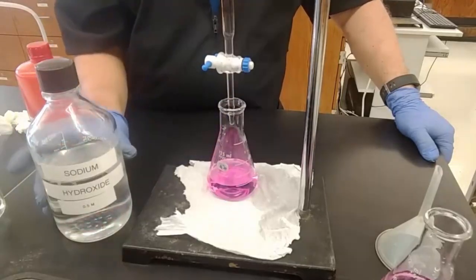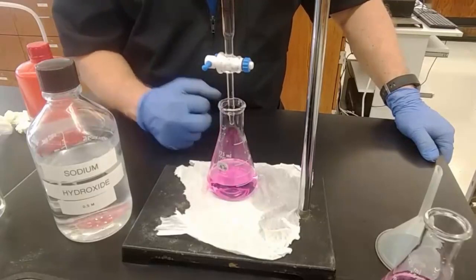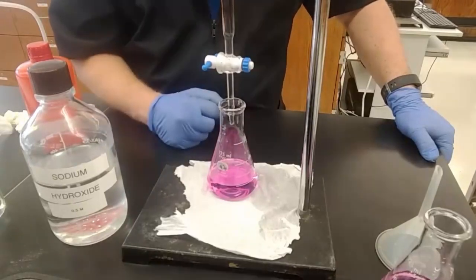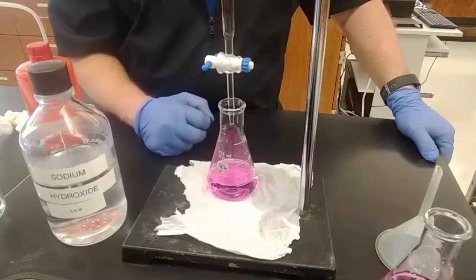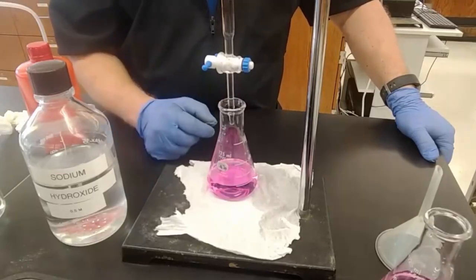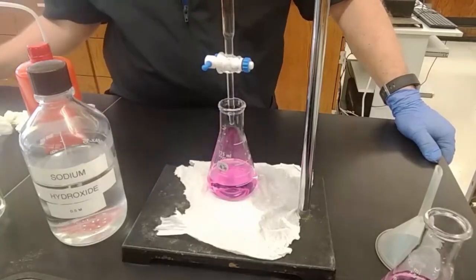Now, does base react with glass? Oh, absolutely. So maybe this base is not as strong as it's supposed to be because it reacted with the glass. That's not the stockroom's fault. That's just science. So if this is less than 0.5 molar because of it reacting with the glass, then it might have taken apparently more of it to react and give you a change in your result. But I'll leave you to discuss that with your instructor.